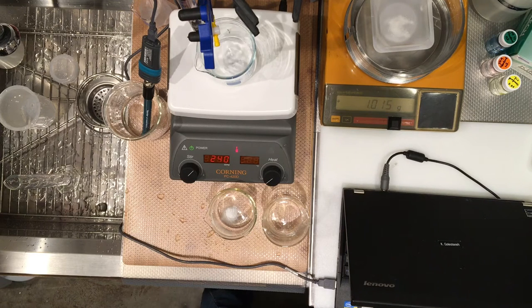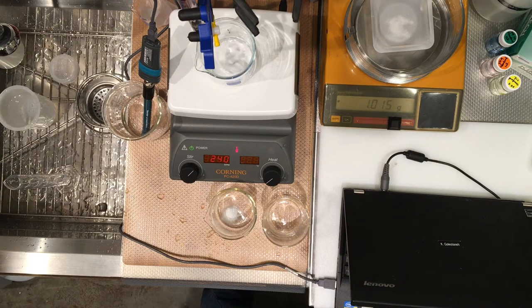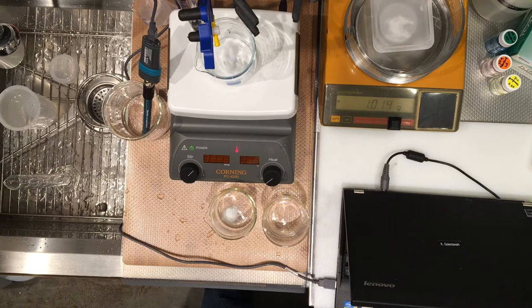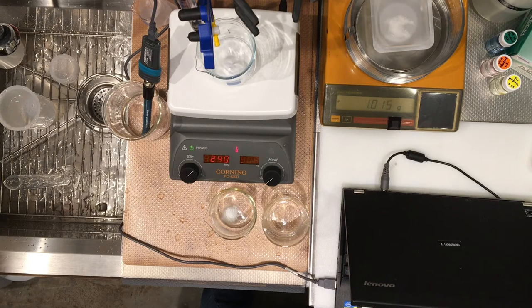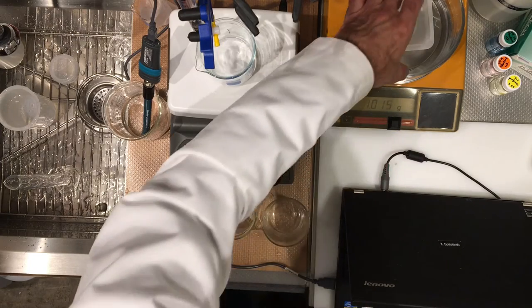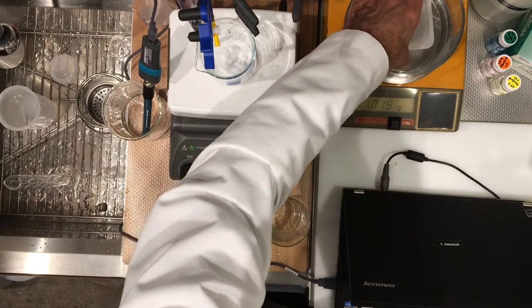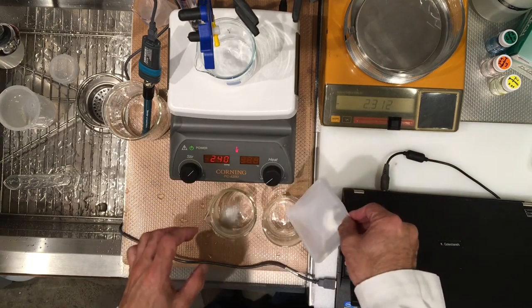Our third sample is 1.015. Okay, let's take that and transfer it to our third beaker.